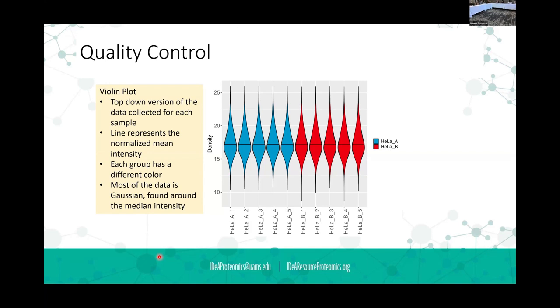And we recommend that. Everyone doesn't want to do it because it adds cost, it adds samples. But especially if you're treating your inputs differently, if you're treating your cells differently, it's really a good idea to submit samples of your input material. But it's crucial that you have equal protein amounts, because that's the only normalization that we can do.